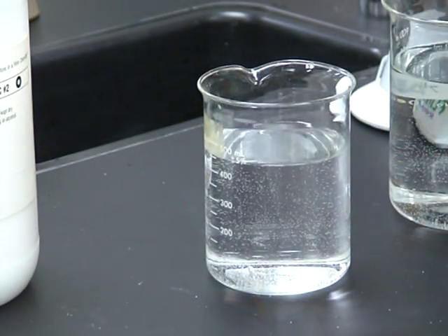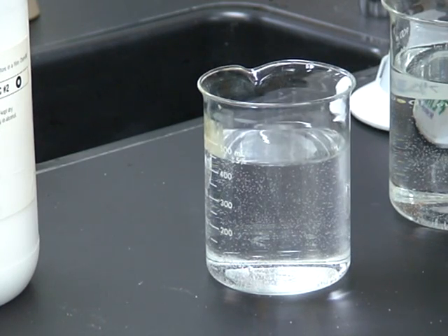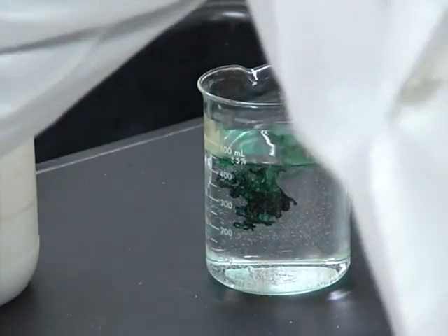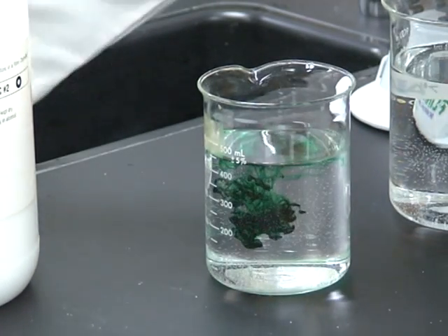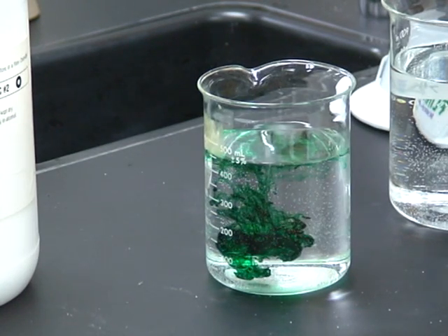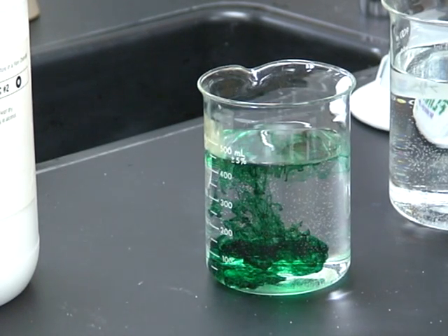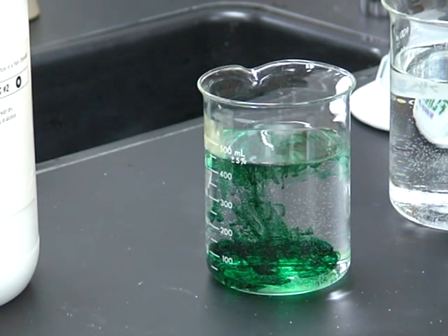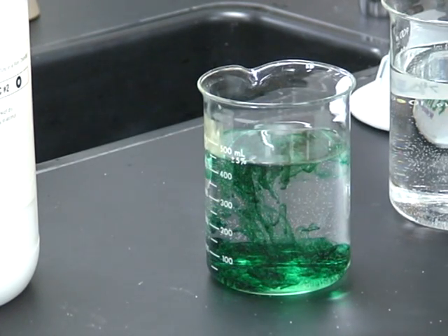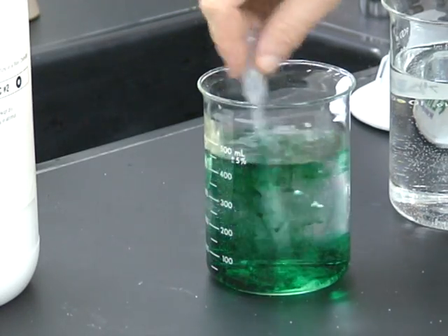Okay, let's try another example. Here is water, and I'm just going to add food coloring to the water. Add a few drops of food coloring, and we'll see what happens here. You can see it's spreading through the liquid. So is that a physical or chemical change? Is something new produced? Let's go ahead and stir it.